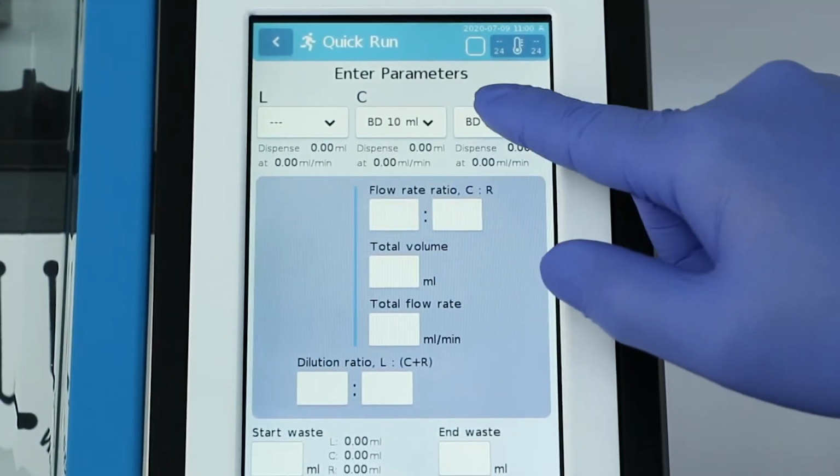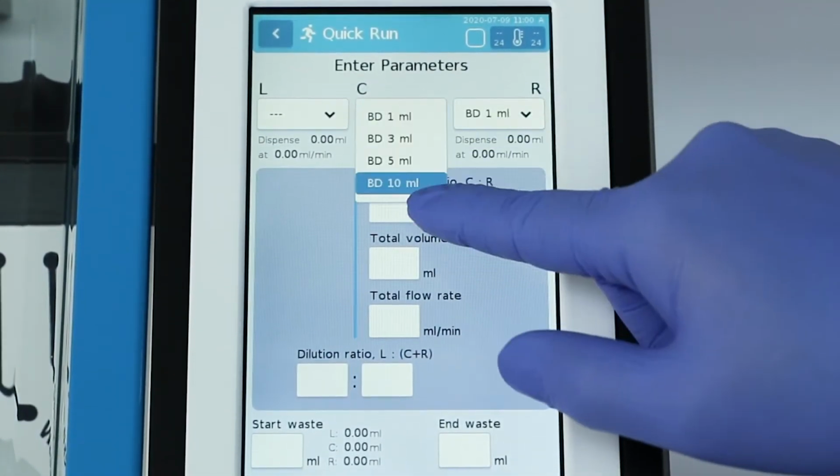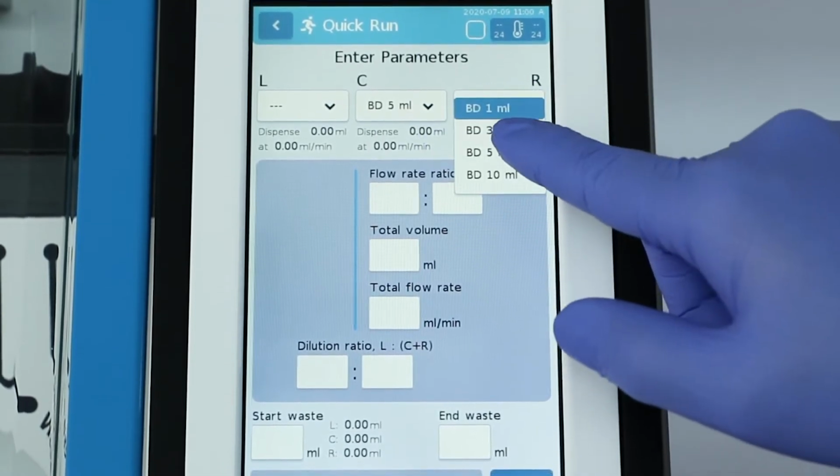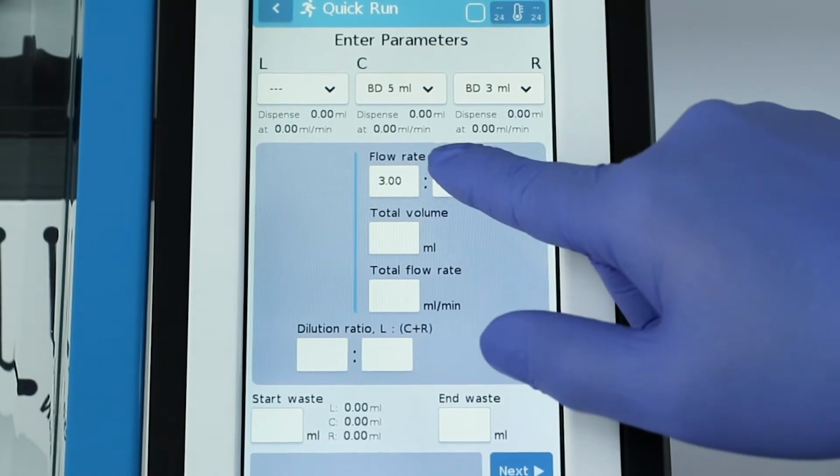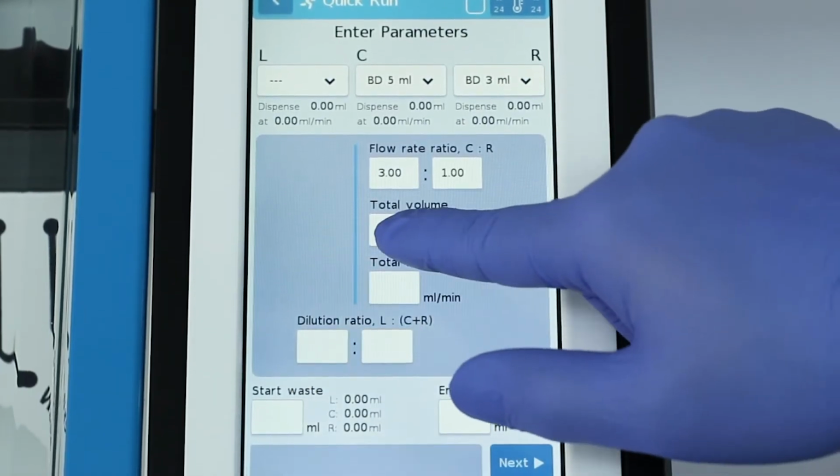In this demo, we'll be making enough lipid nanoparticles to encapsulate all the mRNA needed to meet the dosing described in the Gale 2012 paper. Based on the N/P ratios used, this can be achieved in a single 5 ml Ignite formulation.